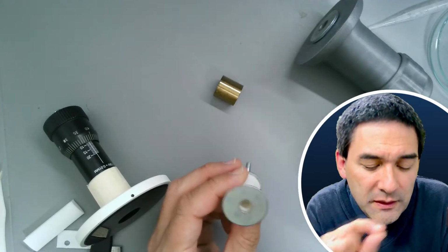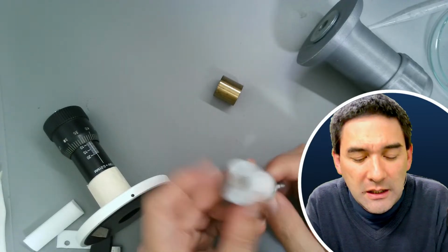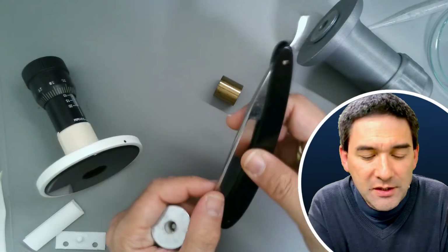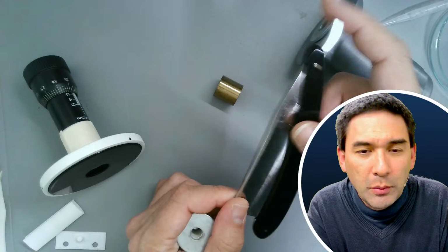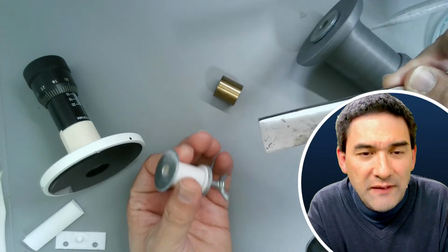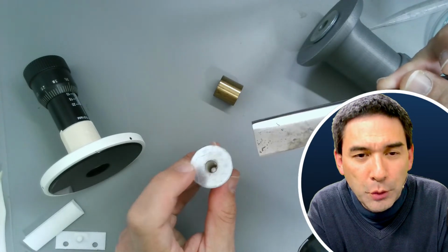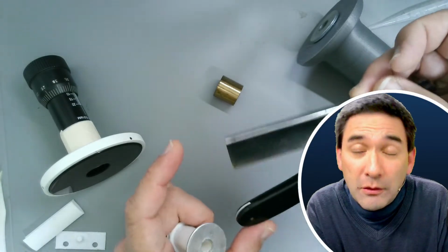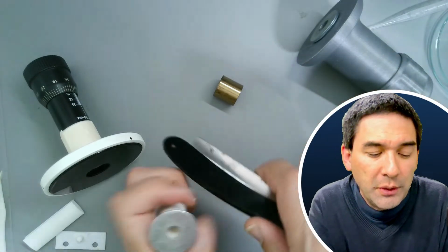We need very, very thin cross sections, and what you do is you put the specimen in here, and then you turn it, and then you use a sharp knife, for example, something like this here. It looks a little bit corroded, but I will also use a razor blade, and then we can cut it across. Then we advance the specimen by turning it a little bit, it's pushed out, and I can make another cut, and then I hopefully have very consistent cross sections which you can put under the microscope.